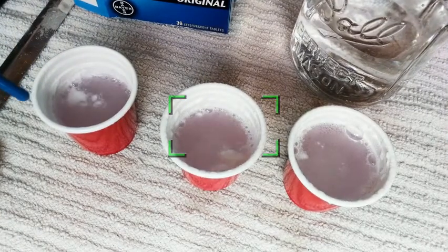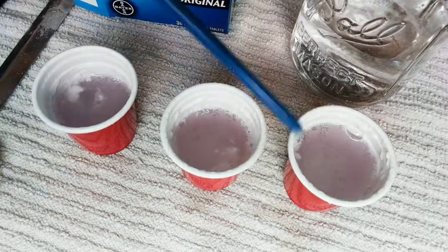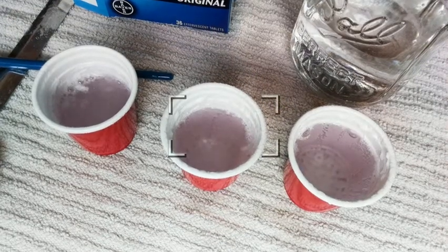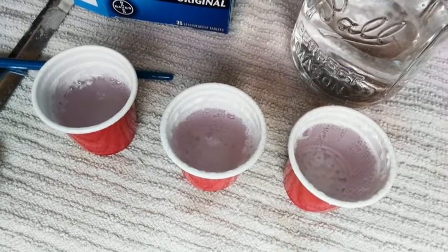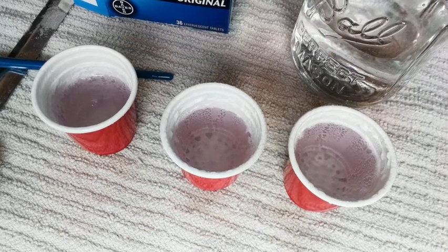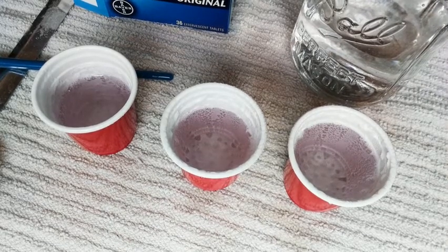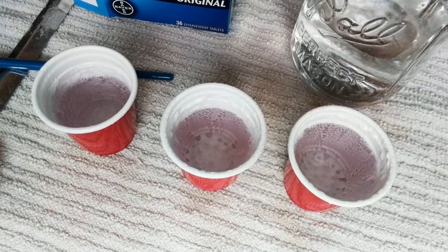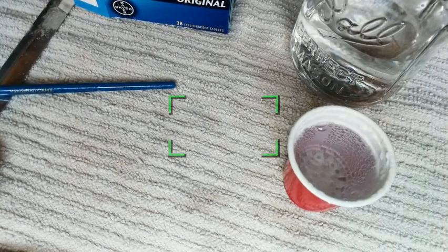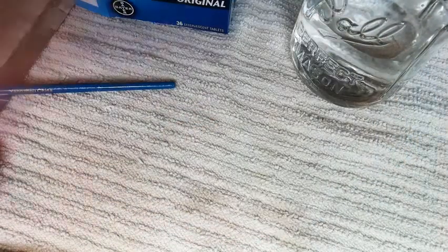This one looks like it's dissolving a little quicker on the end there. So that one here looks like it is just about done. That one was at 1 minute and 3 seconds. The middle one is now done at 1 minute and 11 seconds. And the end one is also done at 1 minute and 13 seconds. All right. So those are complete. Those were our room temperature tablets.